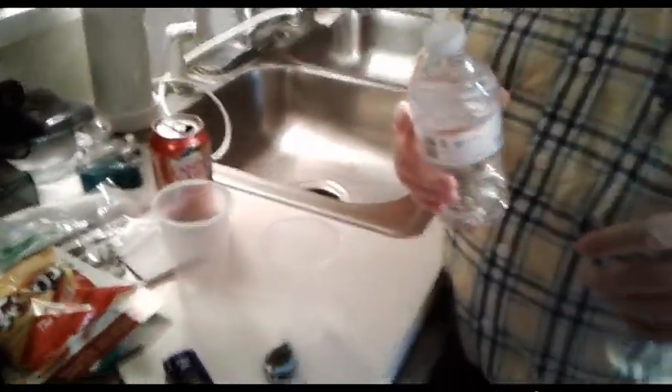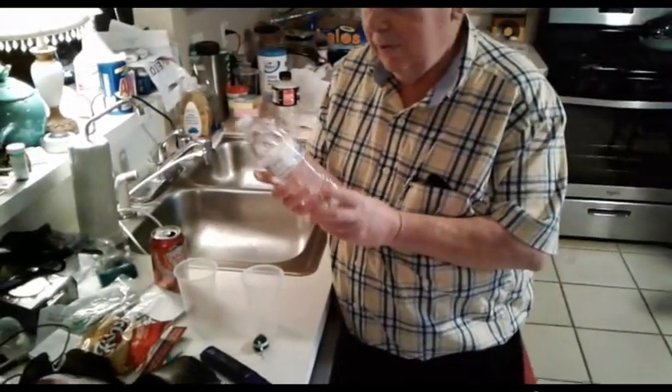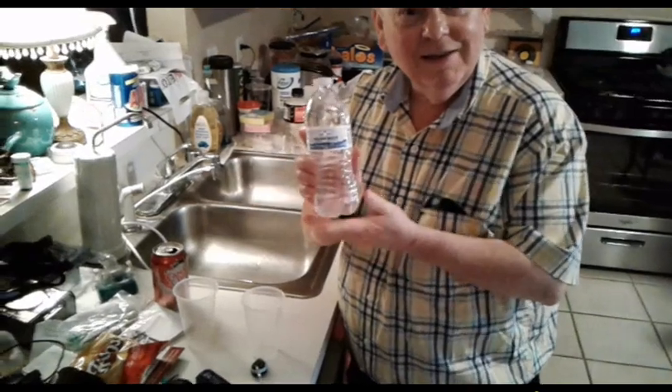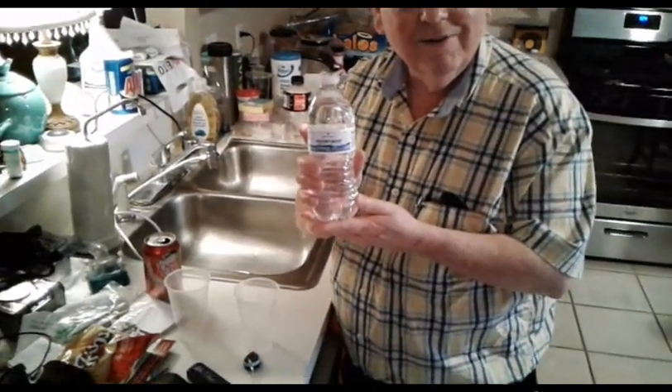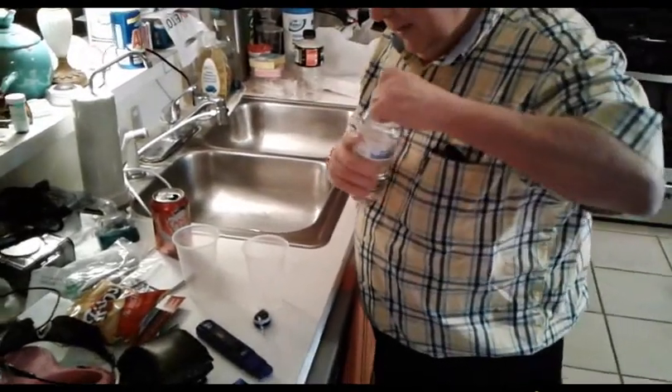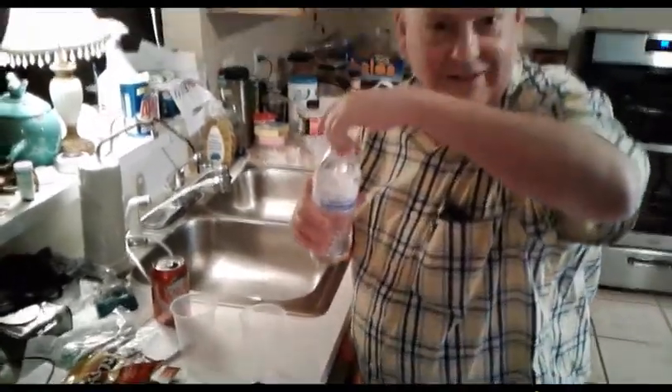I'm going to test Sam's Club purified water. How much does it cost, Robbie? About $4 for a 45-count case. So it's less than 10 cents a bottle? Yeah. And we've never tested this before.